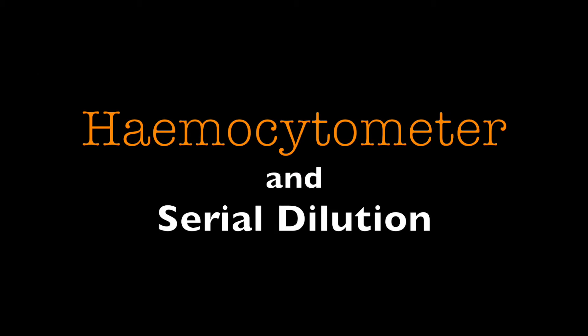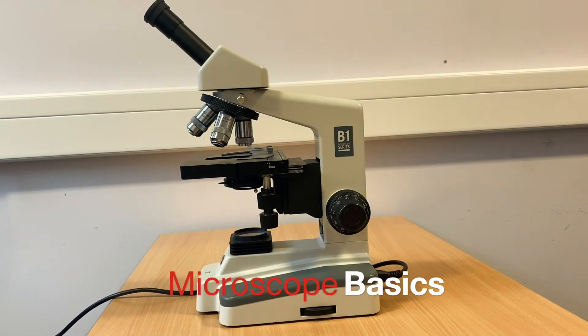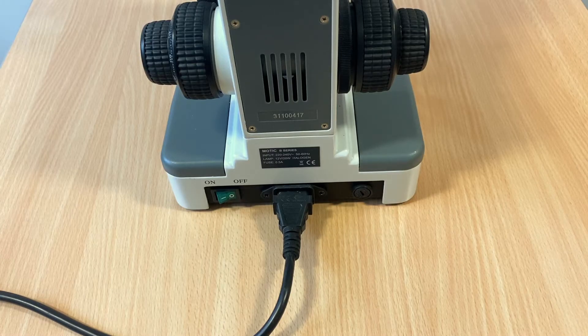Using a hemocytometer and serial dilution. During this practical you will be required to use a microscope. Here is a brief refresher on the use and operation of a microscope.